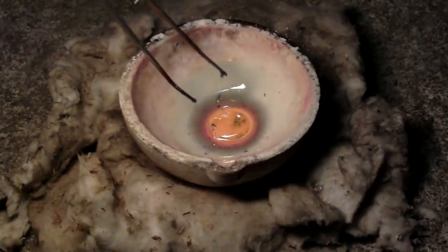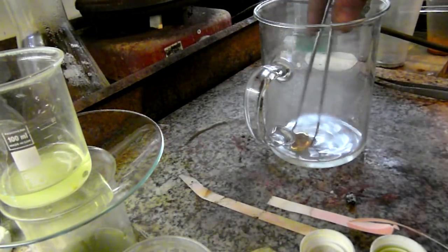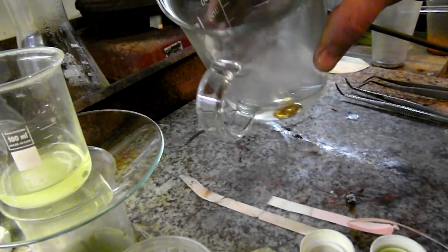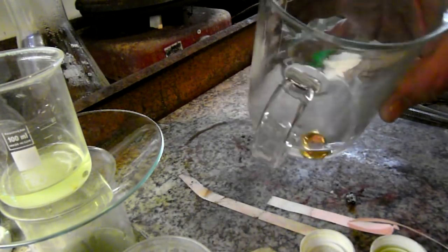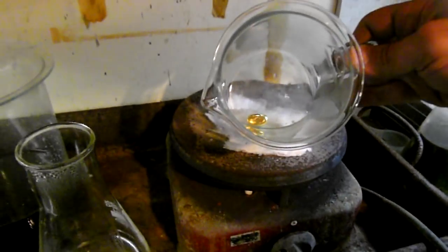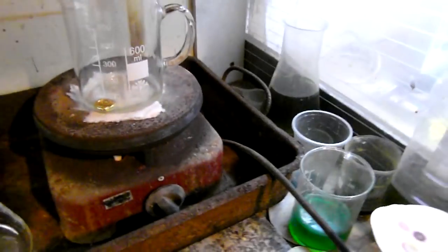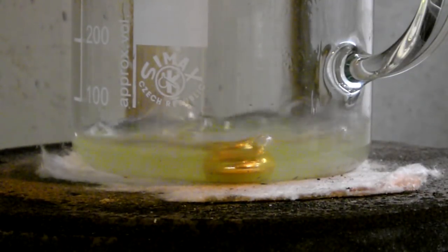Oops, I've scratched it. Boiling in diluted hydrochloric acid to remove the borax.